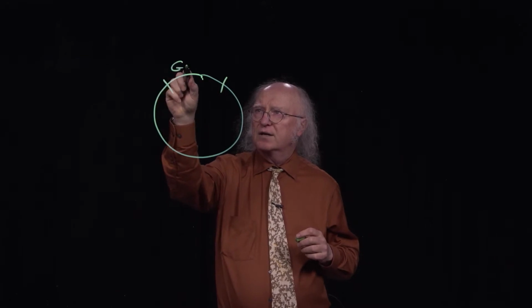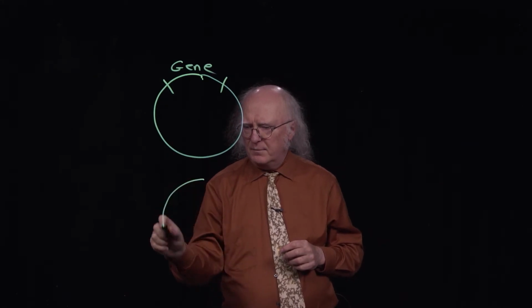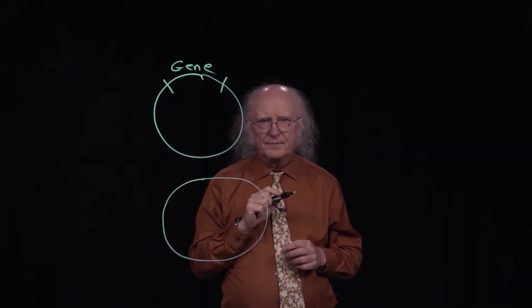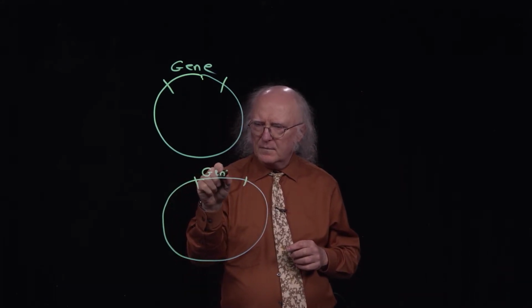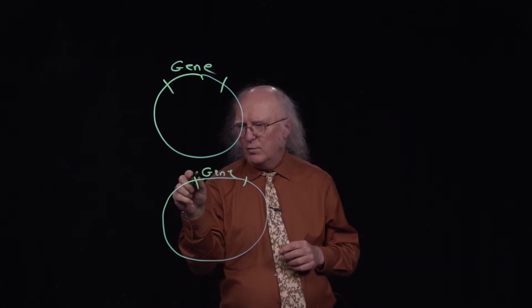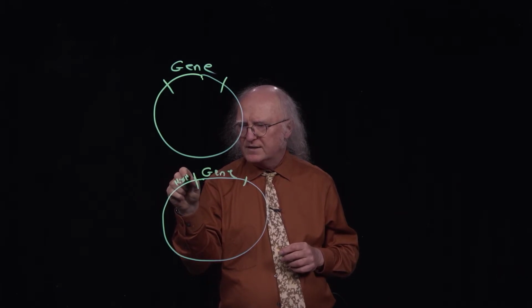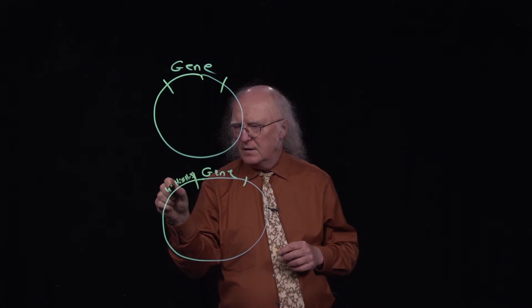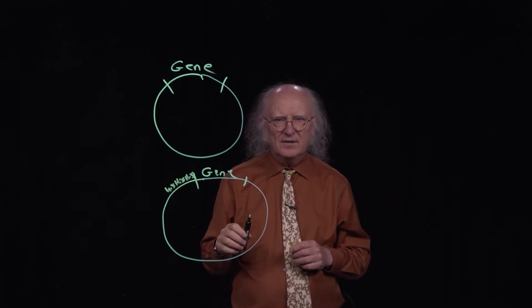So let's understand how that process occurs. Let's imagine that I've got a gene for a given protein. And there's my gene of interest, okay? And I take that gene and I modify it slightly. And the slight modification that I make is, here's my gene, but at the 5' end of where that gene coding would start, I put in coding for the amino acid histidine. And I put in coding for several of these histidines, typically 6 or 8 of these histidines.